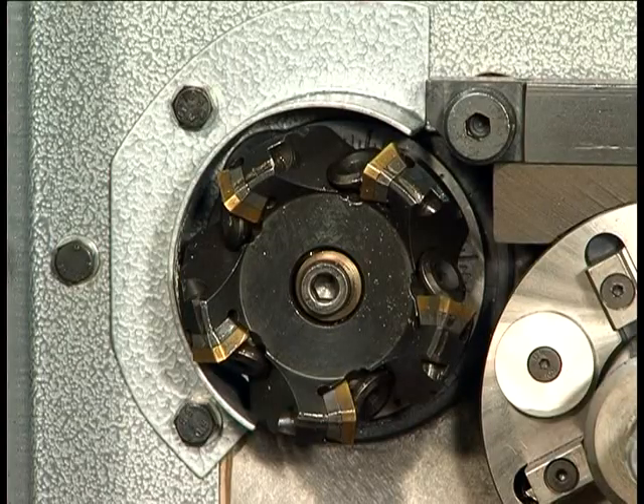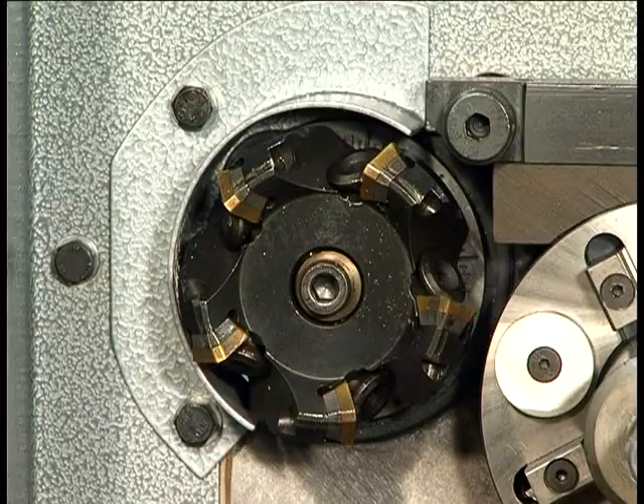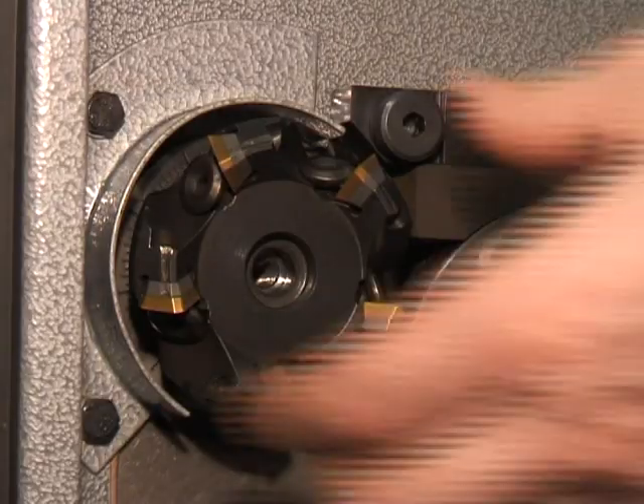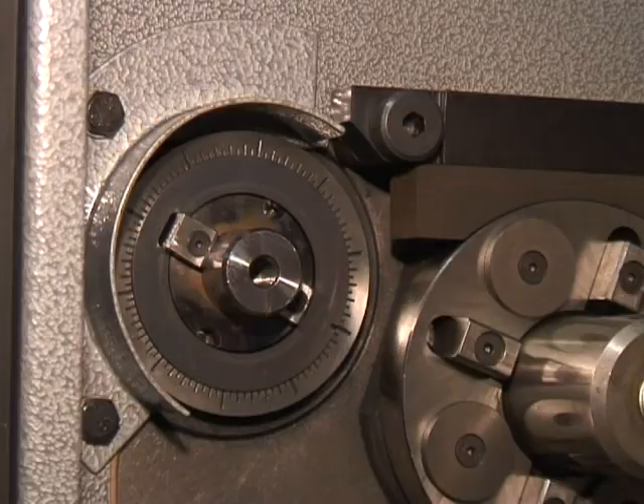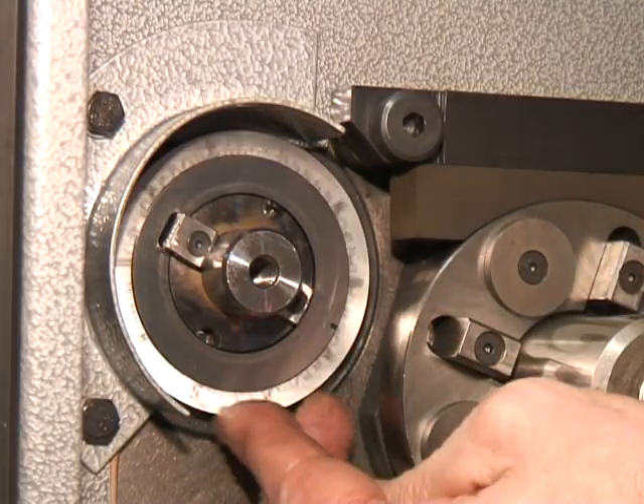Both machines use five tip ISO cutters with easily replaceable inserts. Behind the cutter head is a micro adjustment collar for setting the initial sample size and for cutter tip wear adjustment.